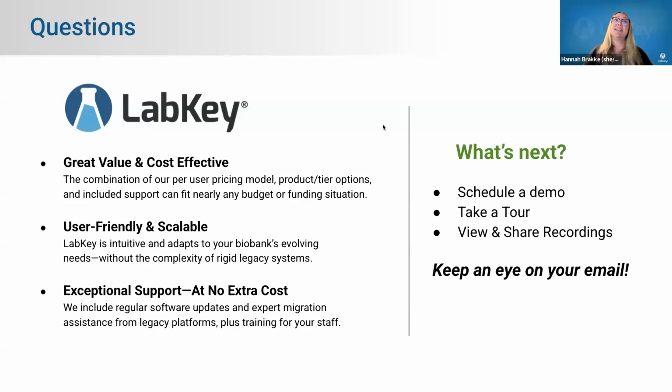And so to wrap up here, in addition, LabKey also provides really great value for biobanks and biorepositories and can be very cost effective. So when we're looking at that sample management tool, that can be a really good entry point for folks with limited resources.